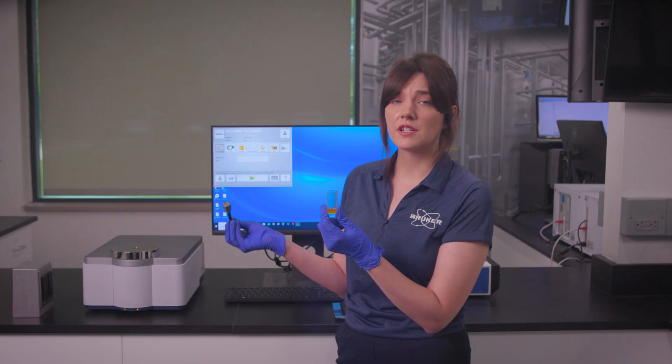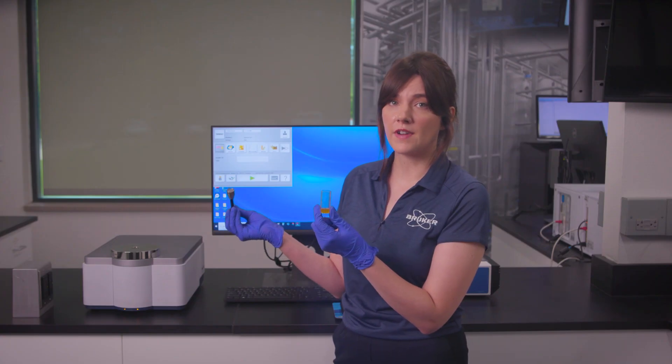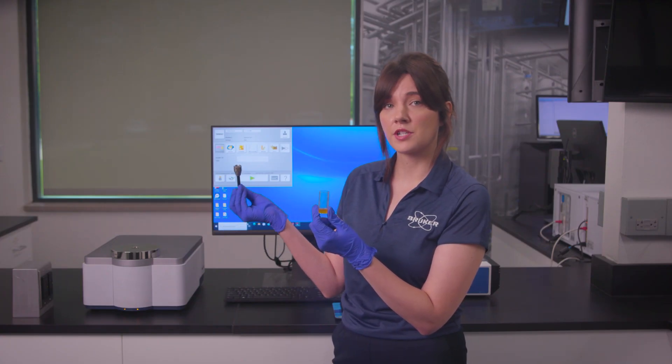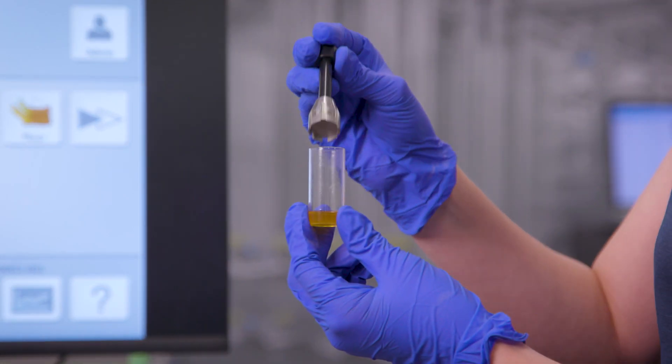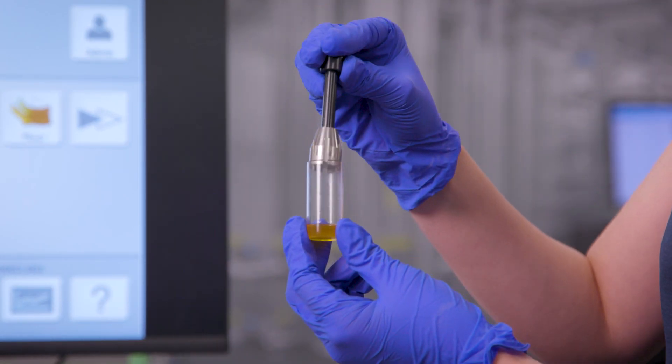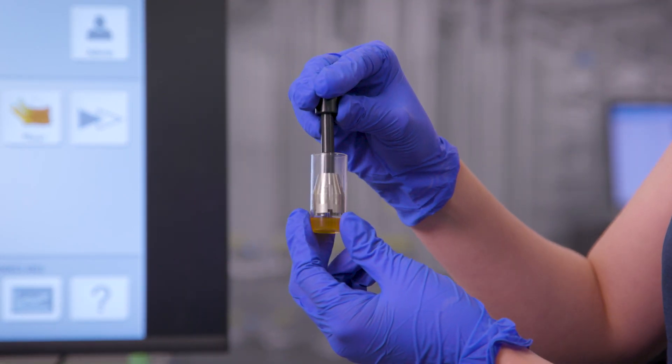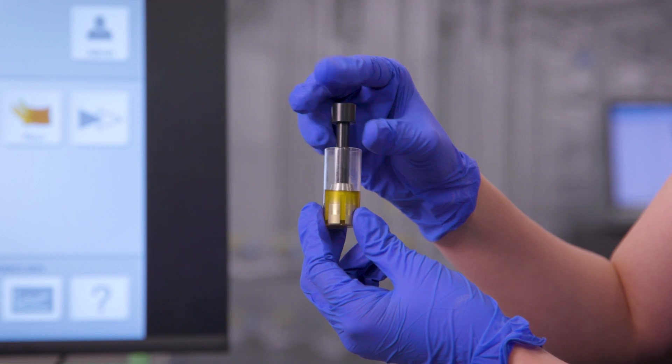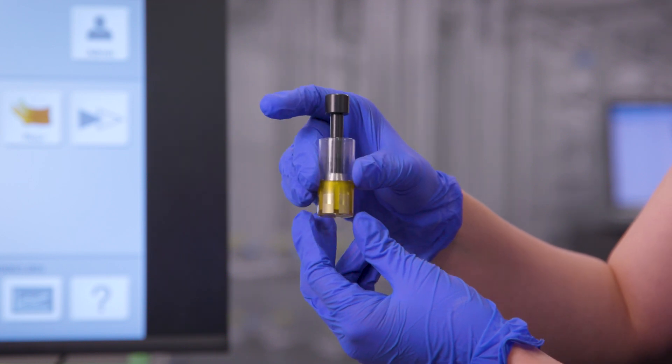We're going to be using a 22 millimeter vial with a transmission stamp in order to measure our poultry fat. We'll fill the vial with enough sample such that when it's displaced by the transmission stamp, it covers half of the transmission stamp.